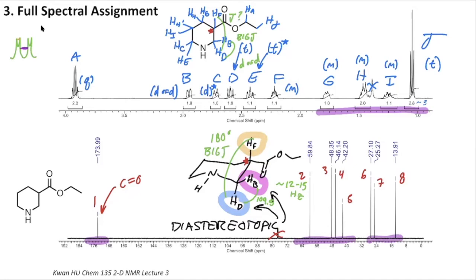When we have two big Js, what happens is that we have a doublet of doublets that are pretty big, like this, where the big J is going to be very similar to the slightly smaller J. So this cartoon doesn't really do it justice, but the case that we're seeing here is that the doublet of doublets has overlapped in such a way that this central peak is moving in that way, and also this one is moving in that way. Or you can think about them as overlapping one another.